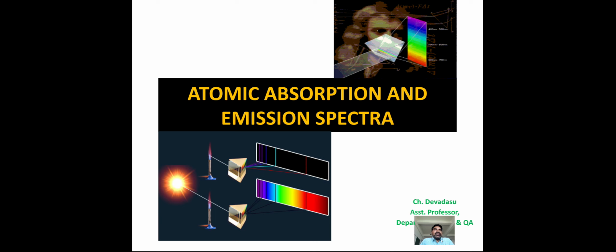You can study either the amount of energy absorbed by the atomic population, or we can measure the intensity of emitted energy after getting excited.